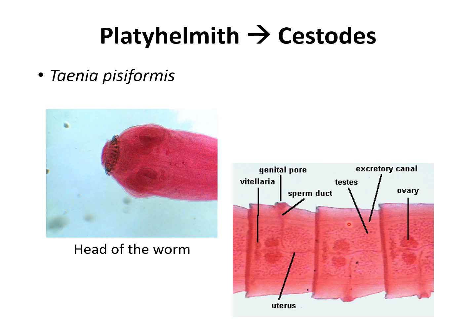segmented parts right there, and within it you can see that this worm has both the testes and the ovaries. So this one is definitely a monoecious worm, and this is how the head looks. And usually right here at the very edge of the head they have these hooks. And so they use the hooks so that they can grab on to the host tissue.